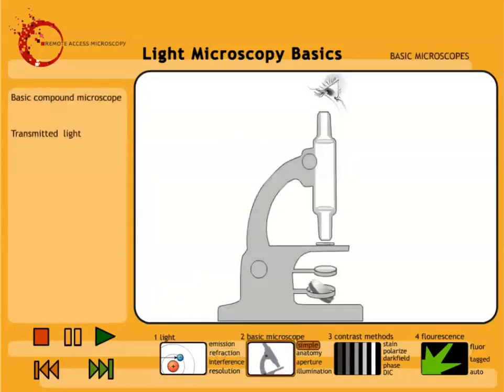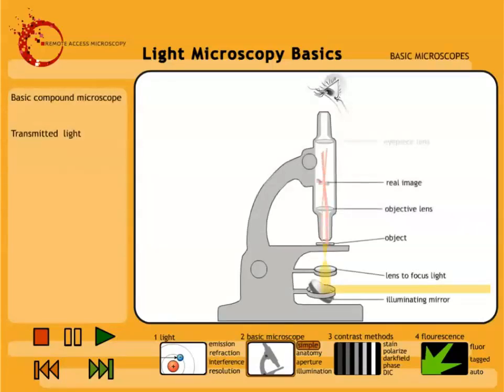The discovery of the law of refraction in 1621 made possible the development of the compound microscope. The basic compound microscope consisted of two convex lenses in series, an objective lens close to the specimen, and an eyepiece lens near the observer's eye.